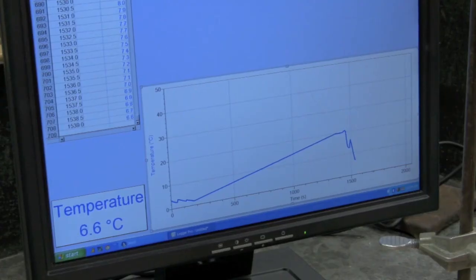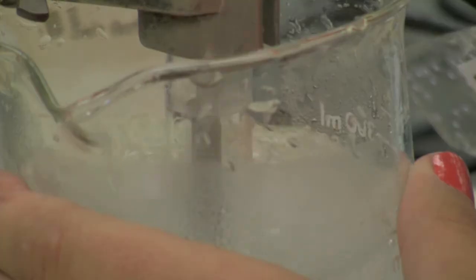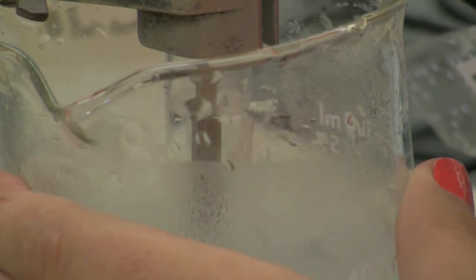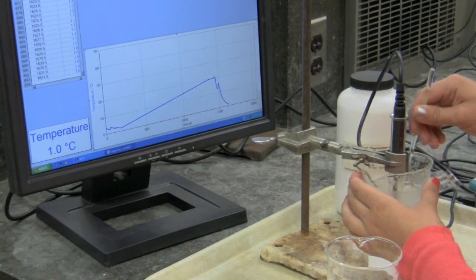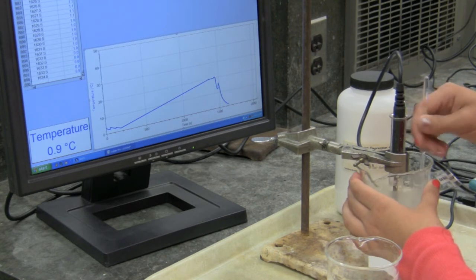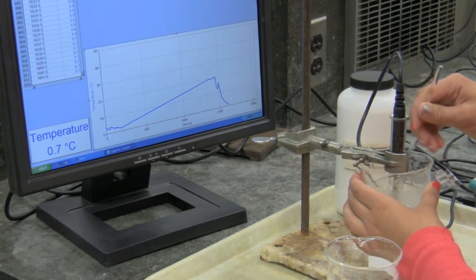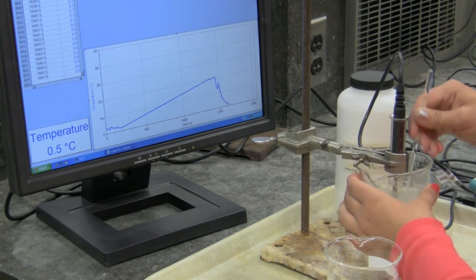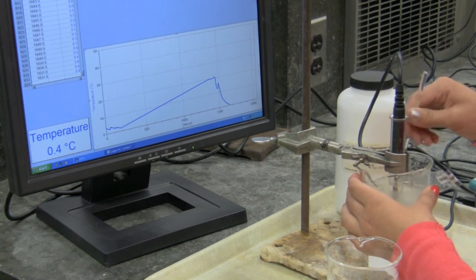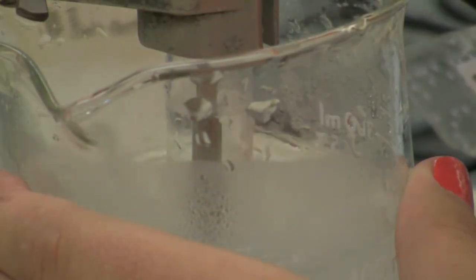The temperature continues to drop: 6.8, 6.4, 3.1, 3.0, 2.4, 2.2, 1.0, 0.9, 0.8, 0.7, 0.6, 0.5, 0.4°C. She mixes the water with a mixing rod while the distilled water and ice water mixture reach equilibrium. Logger Pro continues providing audio feedback as the probe's temperature approaches zero.